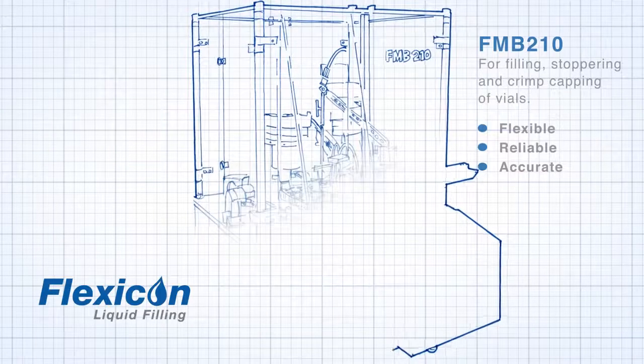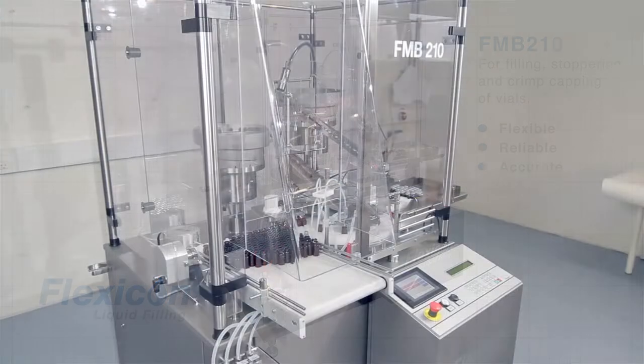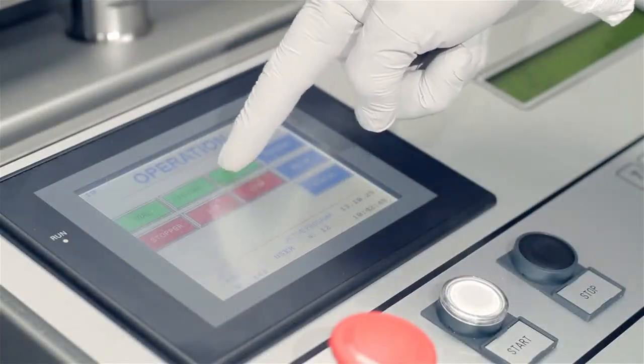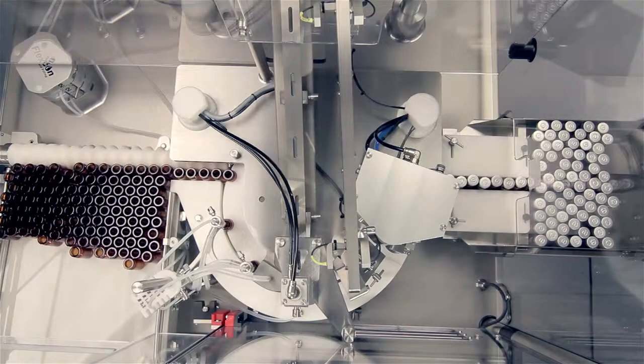Flexicon's FMB210 is a family of fully automatic filling and capping machines. One version of the FMB210 is ideal for filling, stoppering and crimp capping of vials in the pharmaceutical, biotech and diagnostic industries.